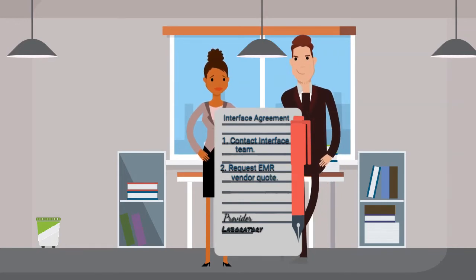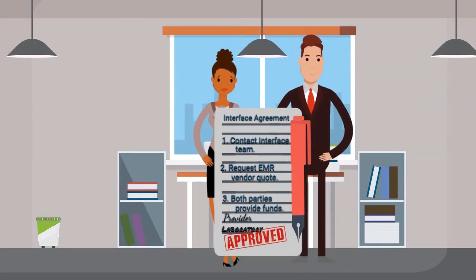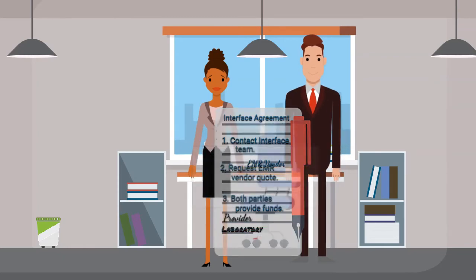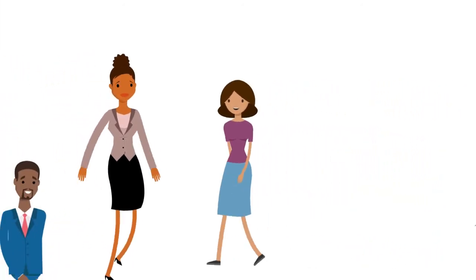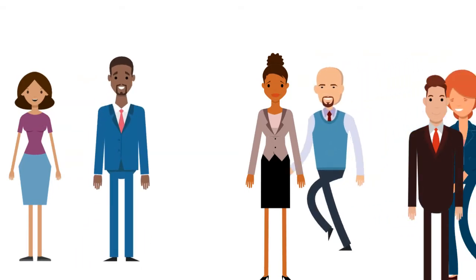Since the laboratory is usually responsible for at least part of the interface costs, administration must be contacted and approval must be received before proceeding. After approval, the payment is sent to the EMR vendor and a discovery call can be set up. The discovery call will help you build your team, which in turn will build your interface.